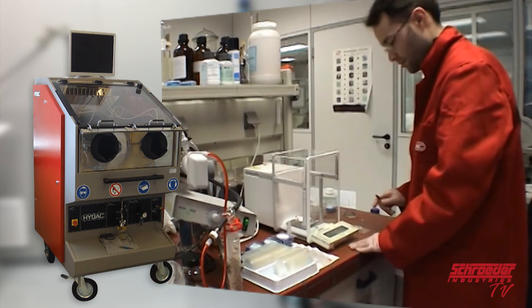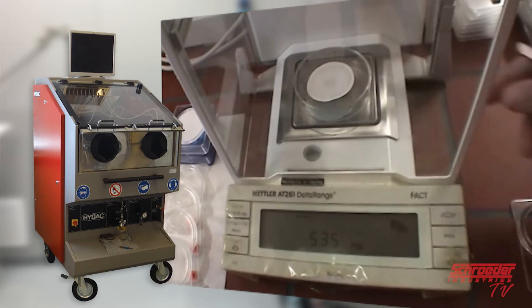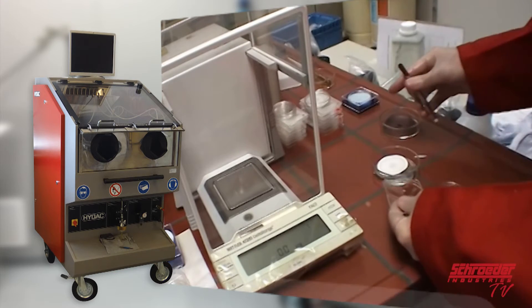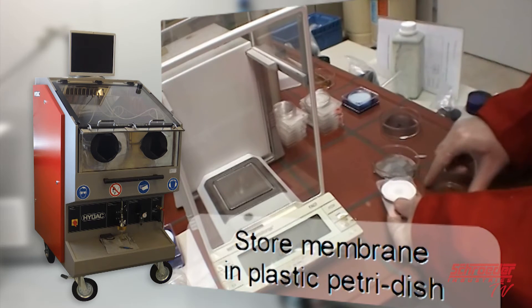The threshold is determined mainly by part size. The larger the part being evaluated, the more surface area it has that can house contamination. Once you have solid weight measurements, store the membrane in a plastic petri dish for safe keeping and to not add any further contamination.